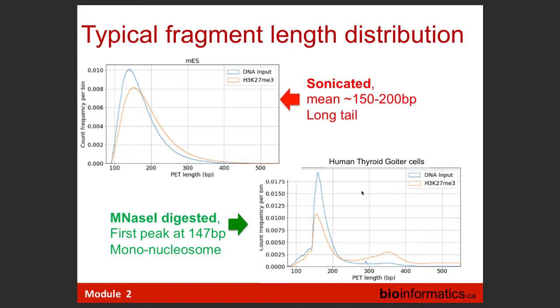So when a pair is outside of this range, where the distance between two reads after alignment is more than 1,000 bases, say, or they align to different chromosomes, or sometimes the distance is even negative. So you can imagine, right? This is possible: one read aligned before, the read one aligned after the read two. Something went wrong, but it's possible. All of those are not properly paired. And this is special in the statistics of the alignment file. This is the special information we always have.